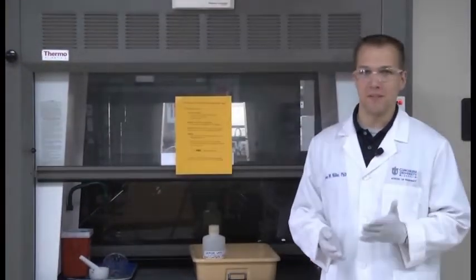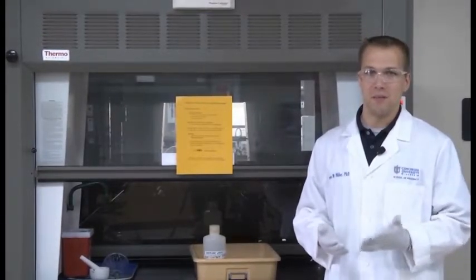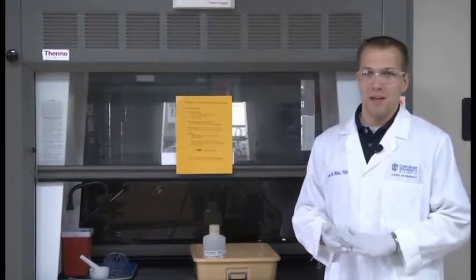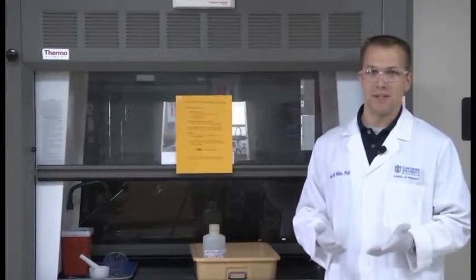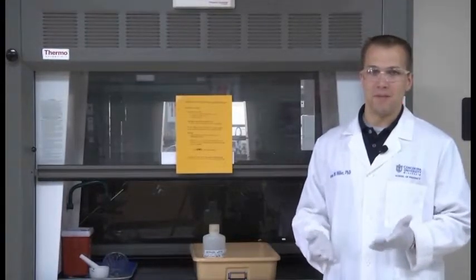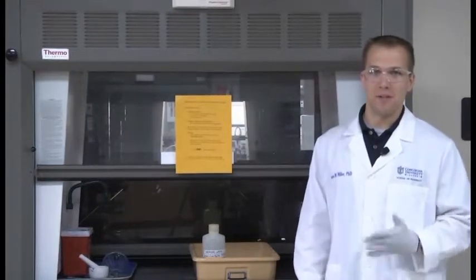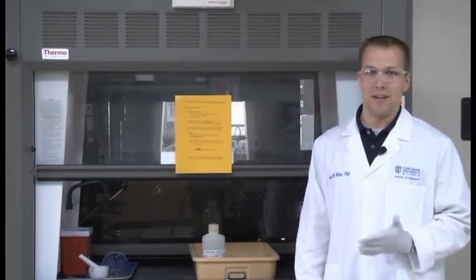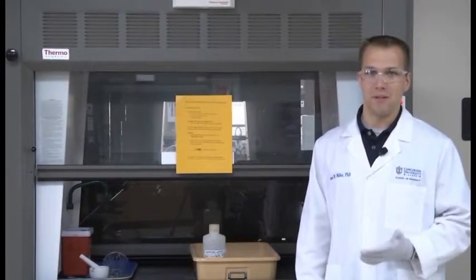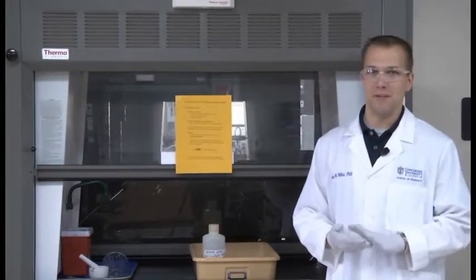One last thing, if you're generating a waste product where you're not sure if it's going to be a hazardous waste or not, if you're going to, for instance, ask a supervisor later whether or not this is a hazardous waste, you can label it with words like unwanted material or unwanted chemicals. And again, make sure you put the full chemical name and the date. But this way, we're not putting the words hazardous waste right away. We're keeping the option open to make that determination later. But we're still marking the container as something that's a waste product, something that we're going to be disposing of at a later time. So that's the summary for hazardous waste.